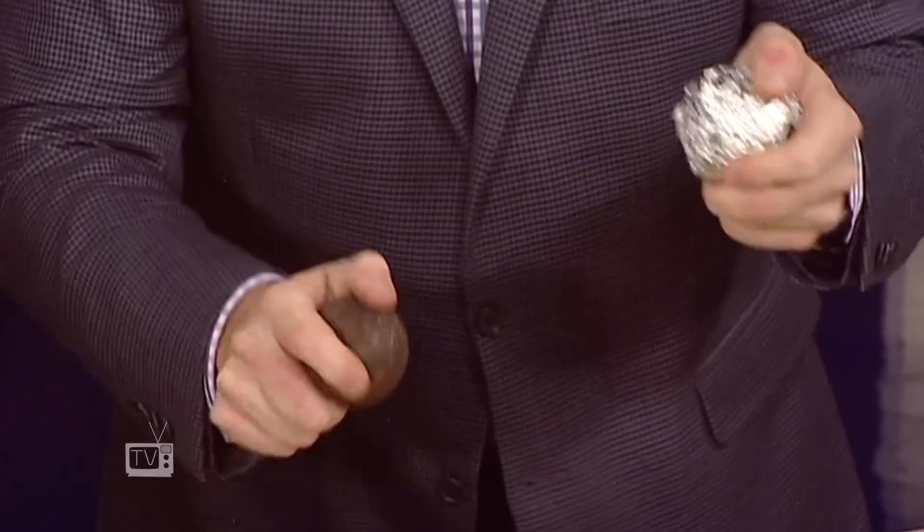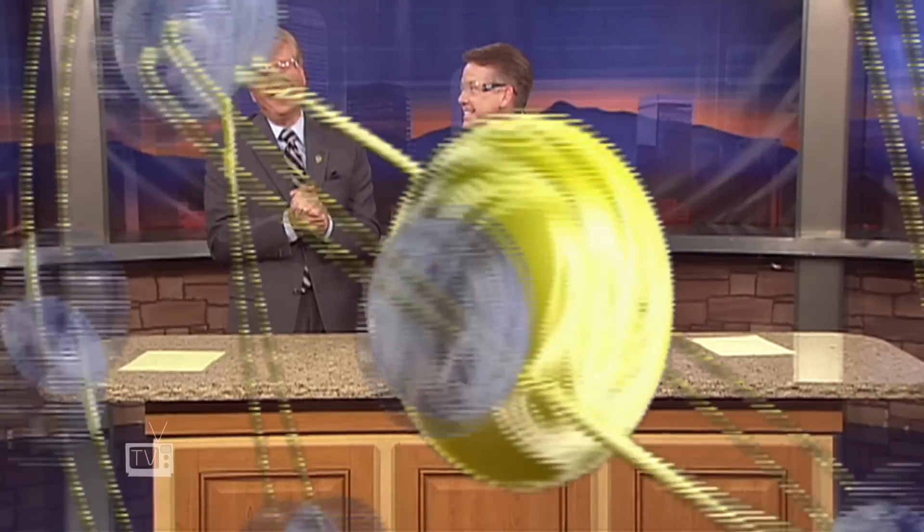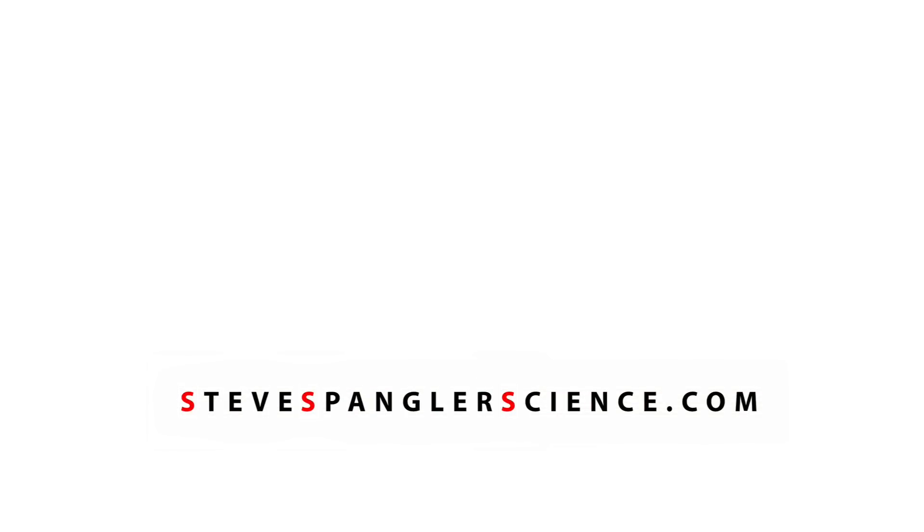Directly to Steve Spangler Science. Look at that — this is a good one! Oh, this is a good one. You got it. This is good.